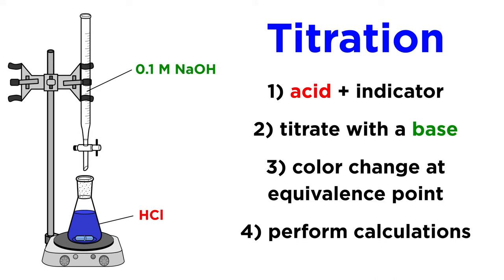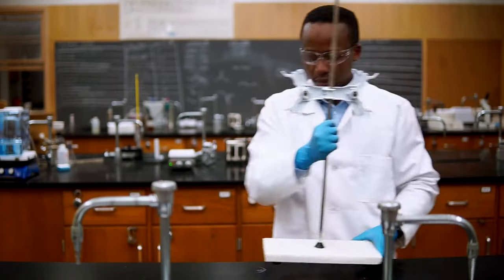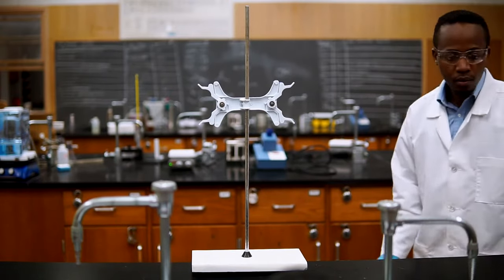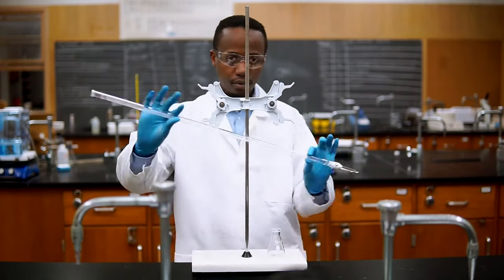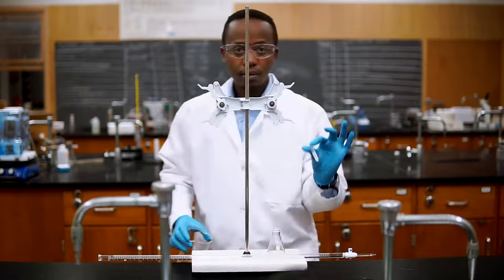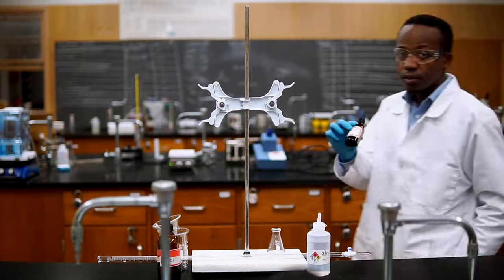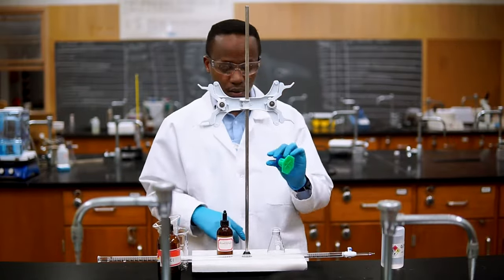Today we will be using titration to find the concentration of a hydrochloric acid solution by using 0.1 molar sodium hydroxide as the titrant. To start, we'll need a ringstand fixed with a burette clamp, an Erlenmeyer flask, a burette, a beaker, a glass funnel, our acid and our base, some indicator, and a graduated cylinder.